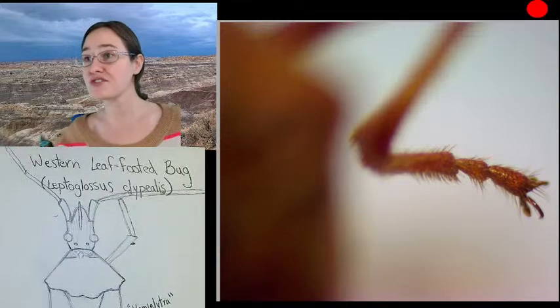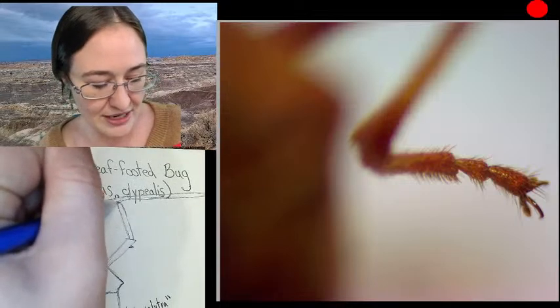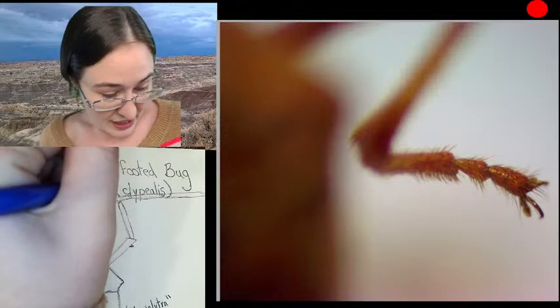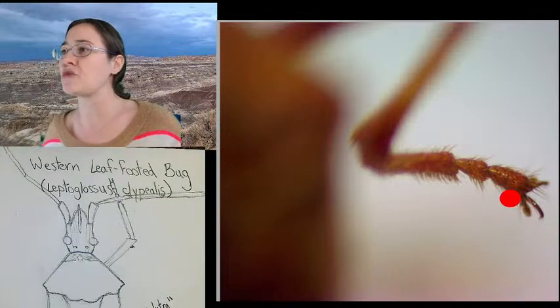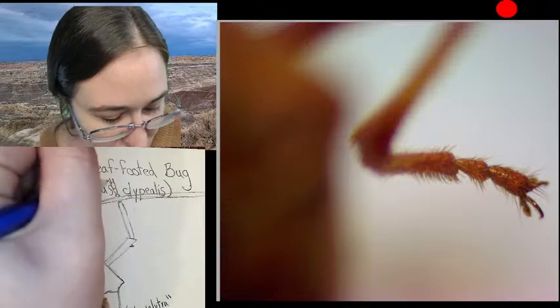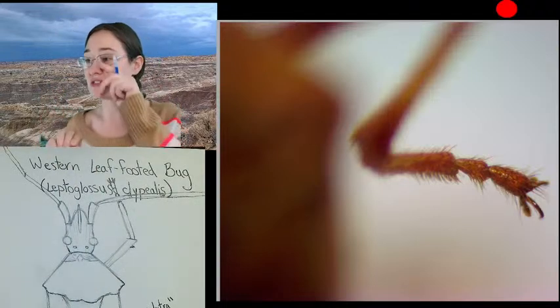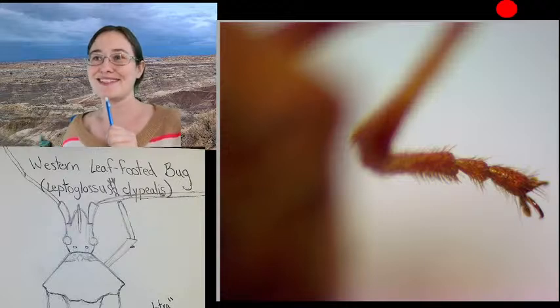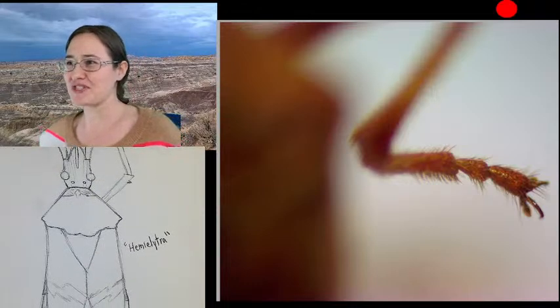All right, so tarsal segments a lot of times are triangular or long rectangles. So this first one is a longer rectangle, and it goes underneath my antenna. All right, and then I've got two triangles and two tarsal claws. And you'll notice that there are some additional little pads here. I think those are called pulvilli, something like that. And our leaf-footed bug actually has two little pads right next to his little tarsal claws. So the tarsal claws are kind of for sticking and holding on to things, but then the pads are not sticky. I don't know exactly what the pads are going to do for our friend here. I wonder if they could be used to clean.